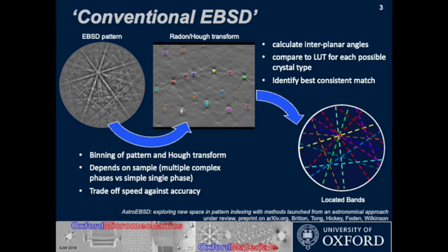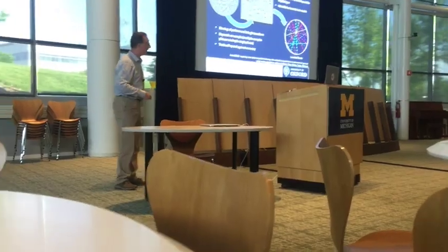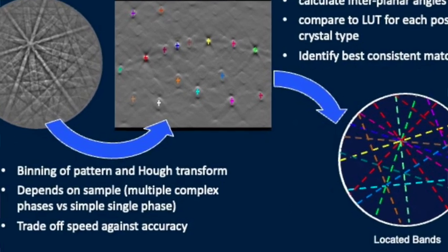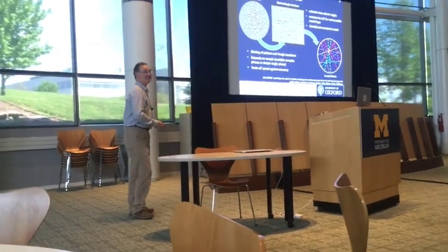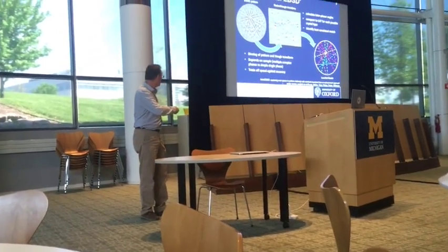Essentially, we rely on going from these beautiful EBSD patterns through a Hough transform or Radon transform to detect these linear features, which become localized spotlight features in the Hough transform, which we can detect, and then we can index, compare if we know something about the crystallography. And this all goes on, and can go on, much more rapidly than we can describe it in the current systems.